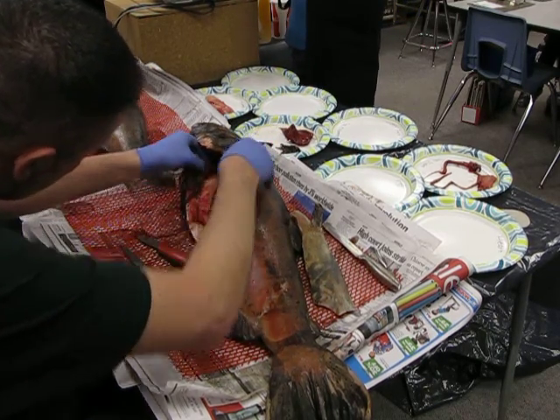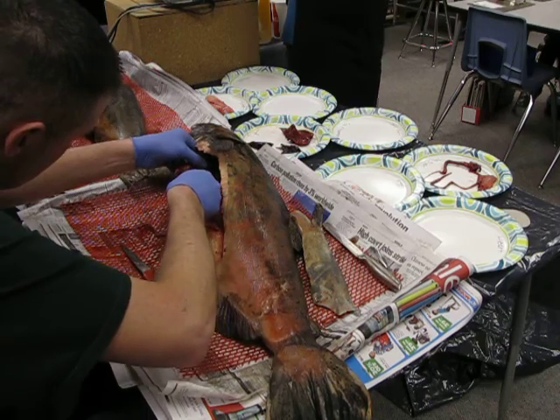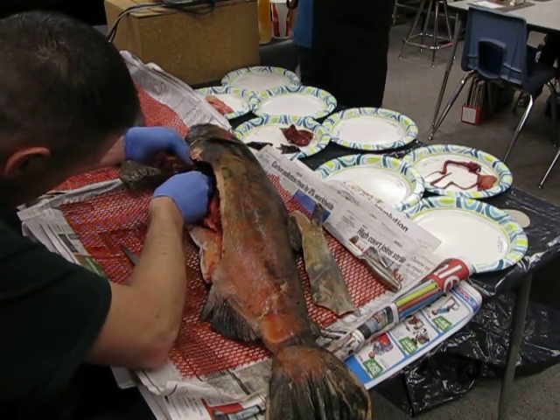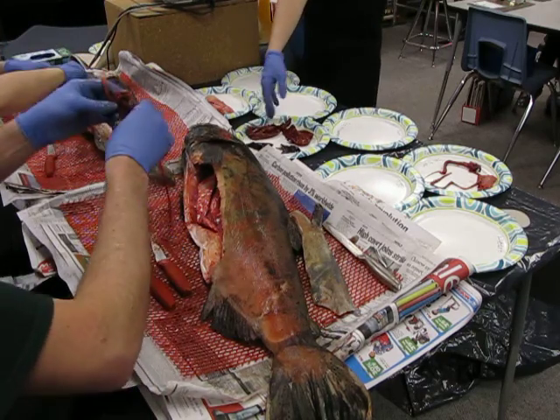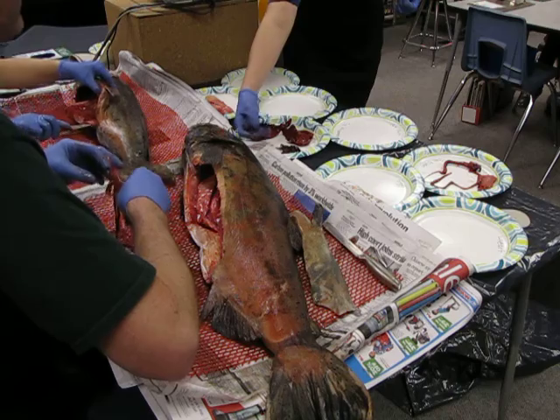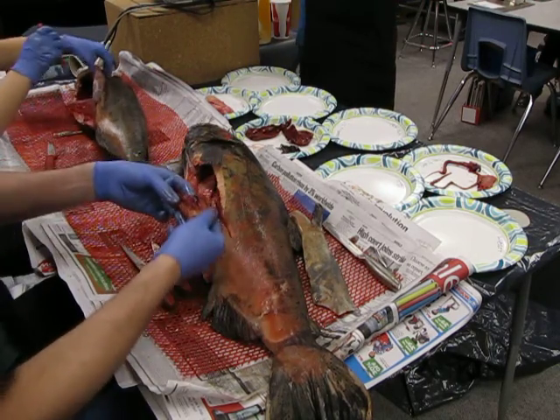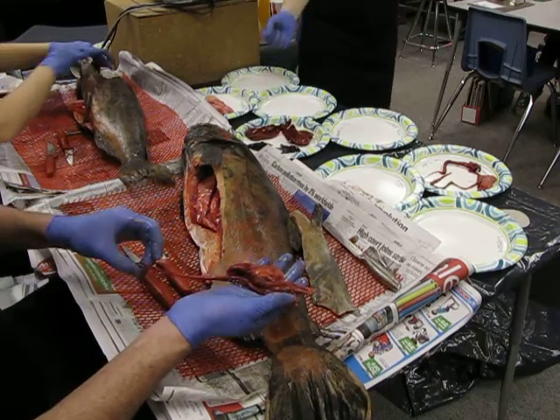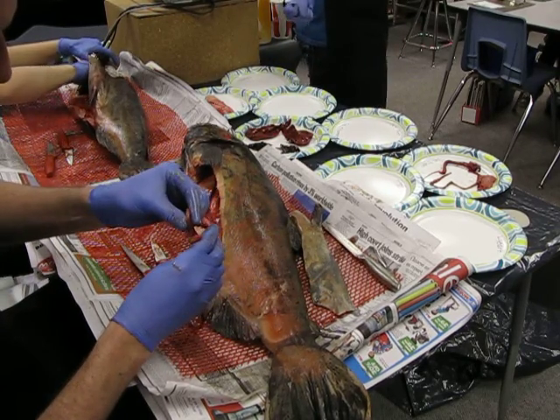You guys have a liver too? Yeah. Big one. Our livers, one of their main jobs is to clean our blood. So the liver of this salmon cleans the salmon's blood. It's really important. They also have another organ that we have. It's called a spleen. This one looks a little bit more like jelly. It's darker. The spleen is super important. You have a spleen too.